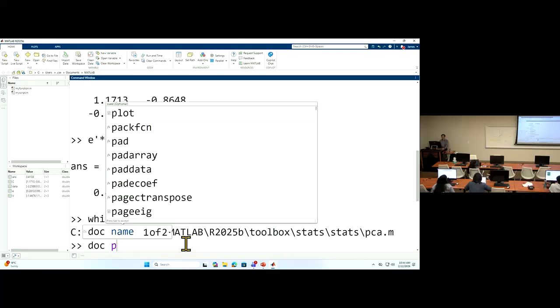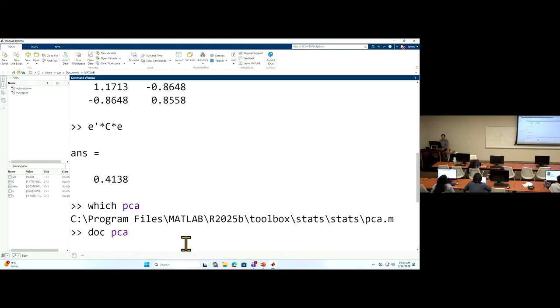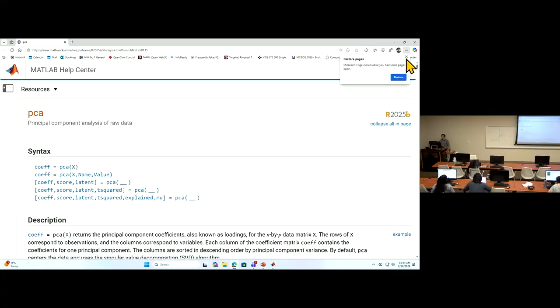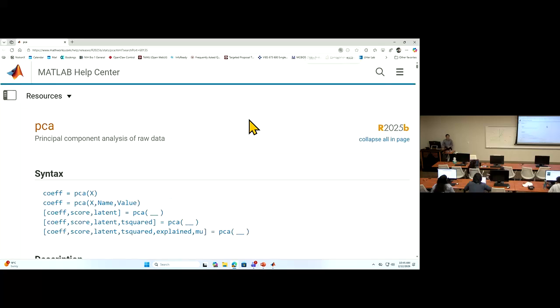What we can do is look at the PCA documentation, and we are going to use examples in there to show. So PCA will be given 3 data points, or more. You need to find a rotation matrix, which is defined by E1 and E2.